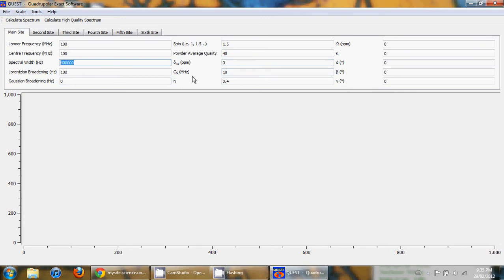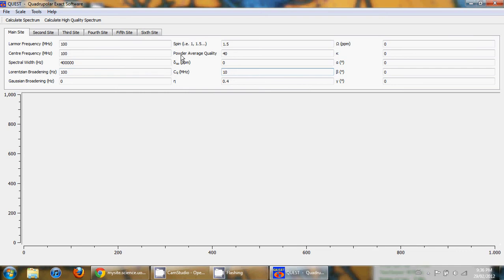The EFG tensor parameters are at the bottom here where we have the quadrupolar coupling constant or CQ and the asymmetry parameter. It's also possible to add a chemical shift interaction by changing the isotropic chemical shift as well as the span and the skew.